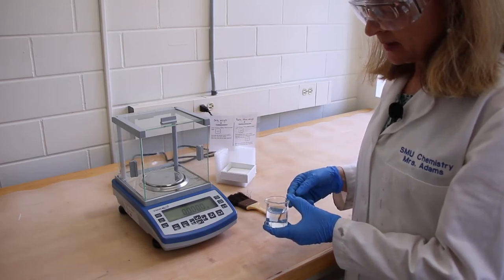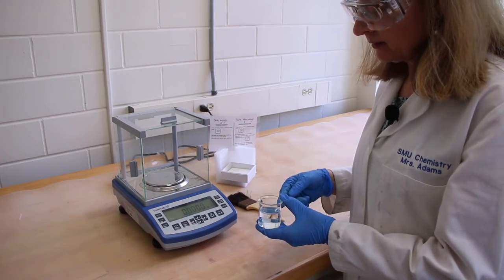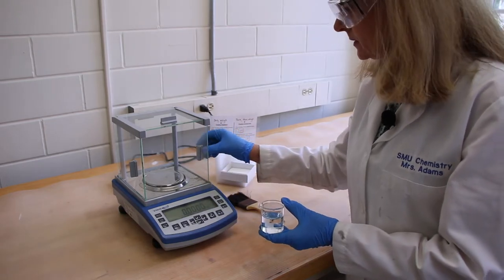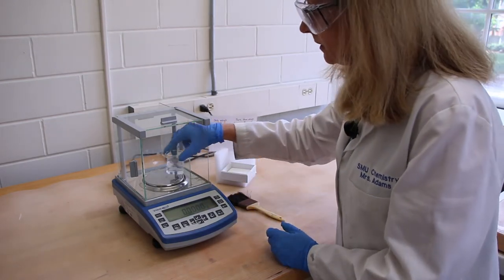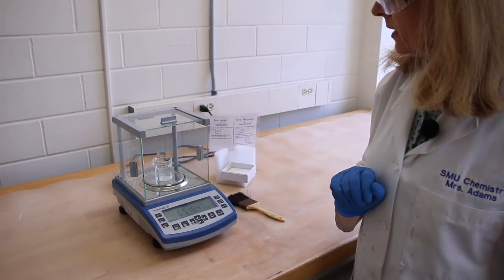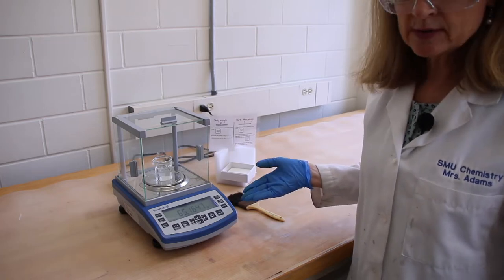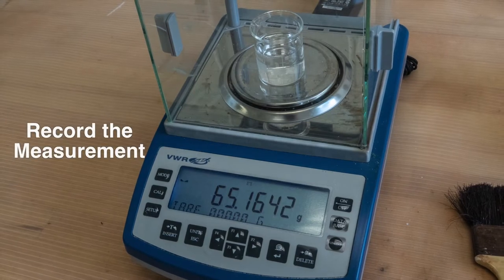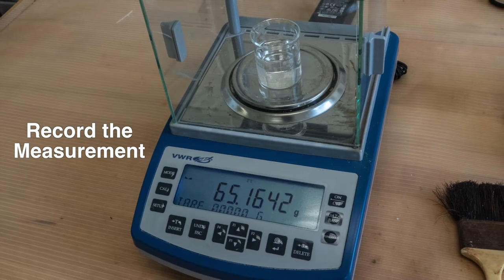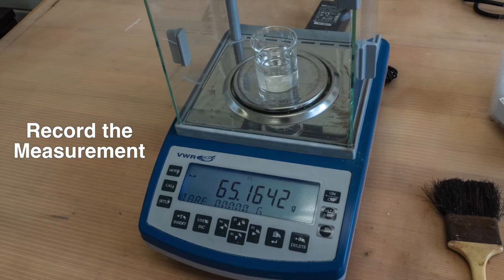Our final step in this part of the procedure is to weigh and record the beaker with water in it. Our scale reads 0. Put it on the balance pan, close the door, and I'd like you to read and record this value. The density formula is given in your data sheets — please calculate the density of the water and be sure to include units in your answer.